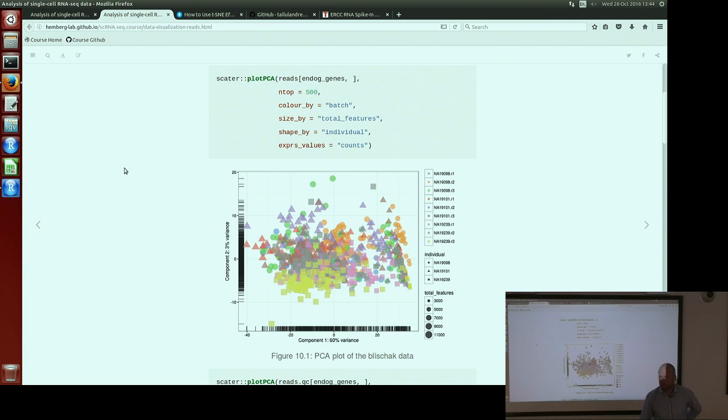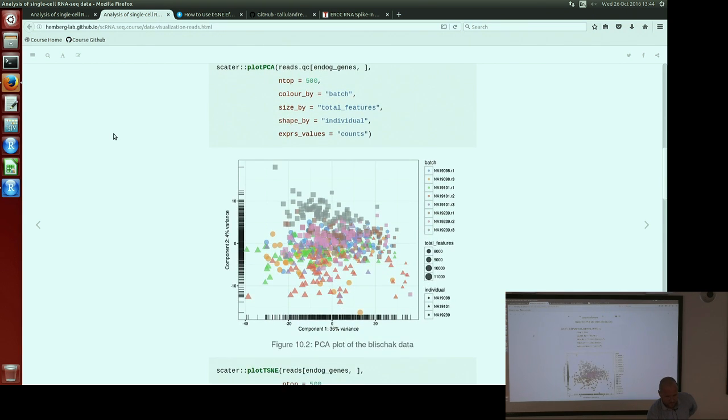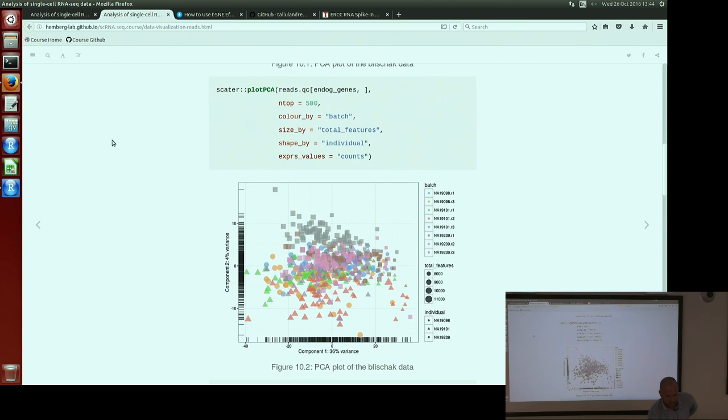So it's quite different. And as I said, UMIs are usually much cleaner. Now, if we look at it using the quality controlled data set, it becomes even more homogeneous, which is actually good because we removed different cell outliers, and that made the image more homogeneous.